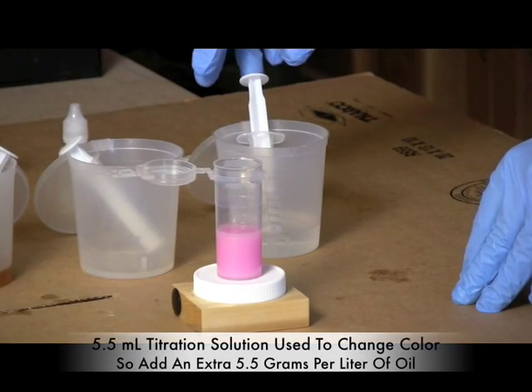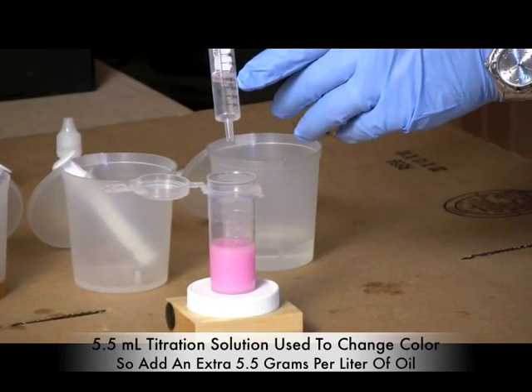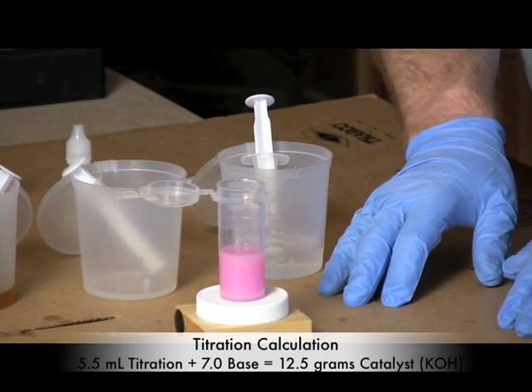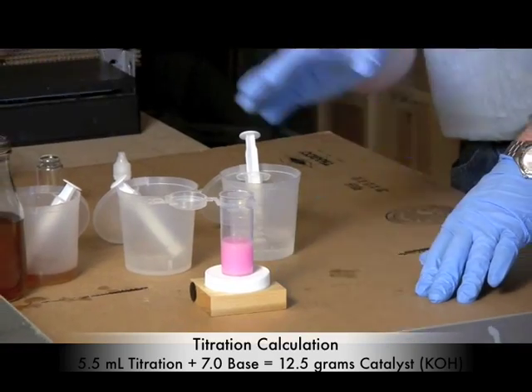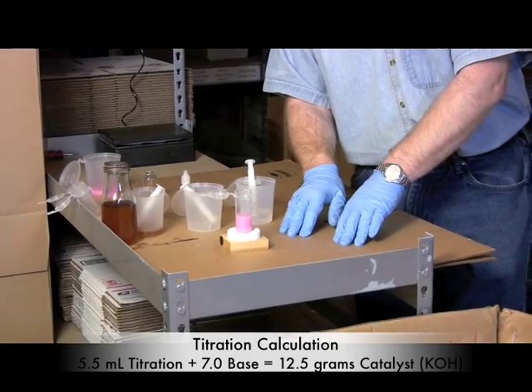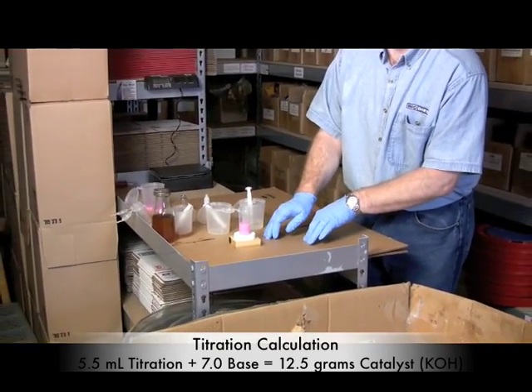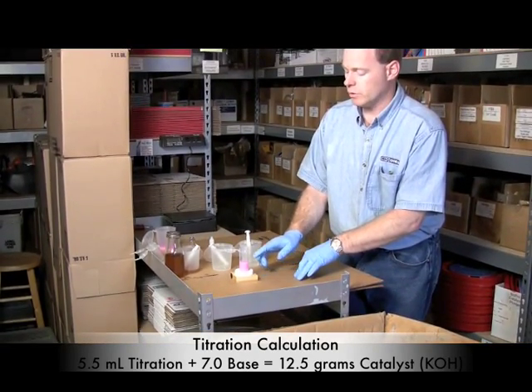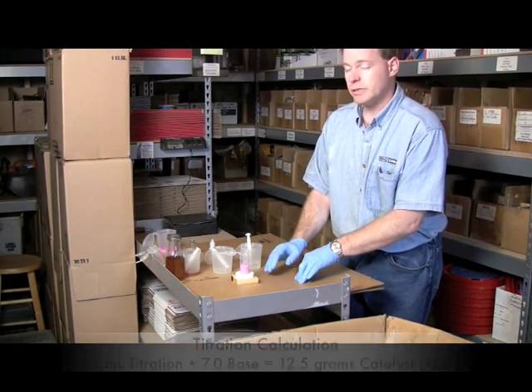We've now put in 5.5 milliliters of titration solution to turn the solution pink and keep it pink. The basic math says it will take 5.5 extra grams per liter of oil. Since we used potassium hydroxide, the base amount is 7 grams per liter, so 7 plus 5.5 equals 12.5 grams per liter of oil — that's what's necessary to make biodiesel from this oil. That's how simple it is to titrate.